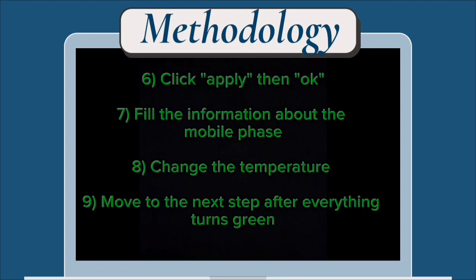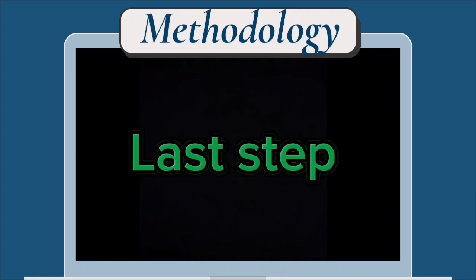Number 8, we change the temperature based on the sample used. Number 9, move to the next step after everything turns green. Finally, we move to the last step.